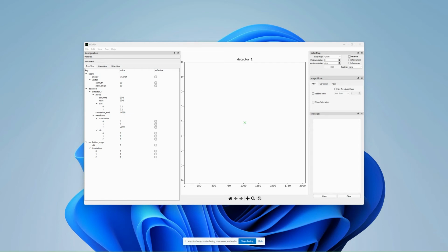Greetings, hexRD users. In this first video in the TARDIS Analysis series, I'm going to step through the procedure for importing raw data from the NIF-SHOT archive into the program. So we start by opening the hexrdgui.